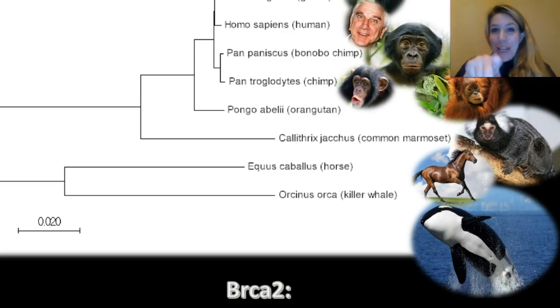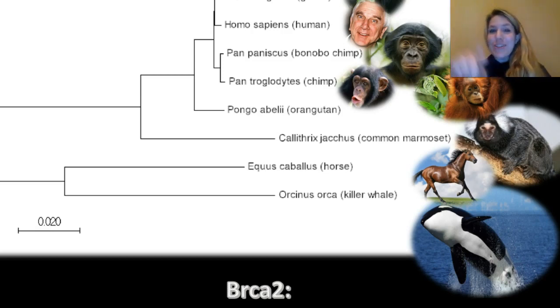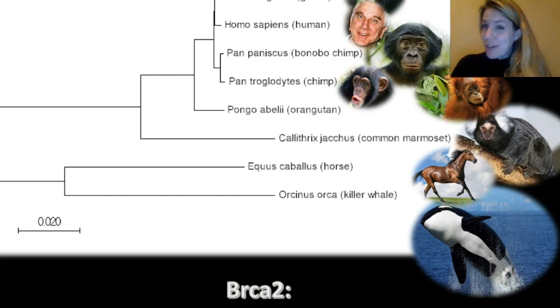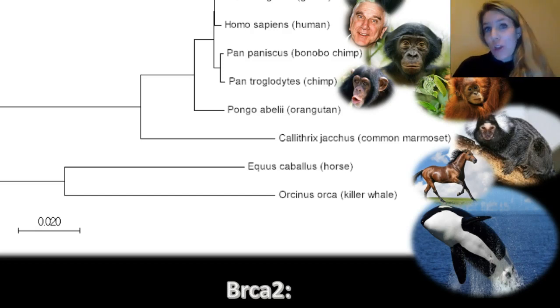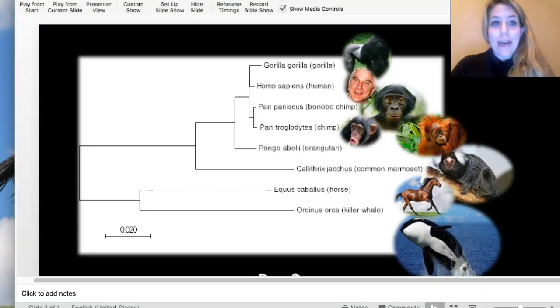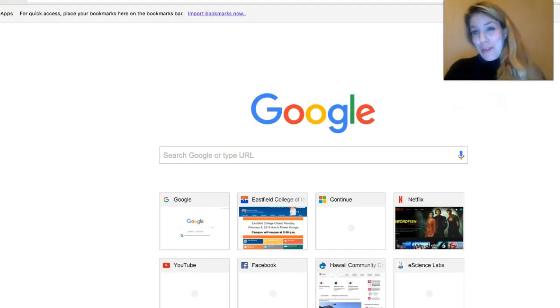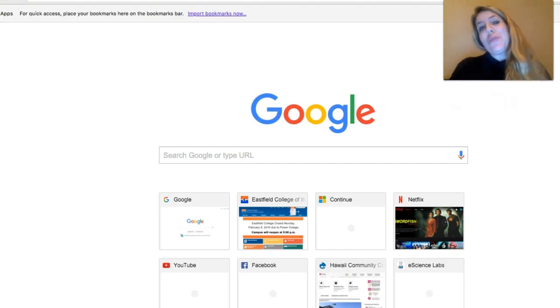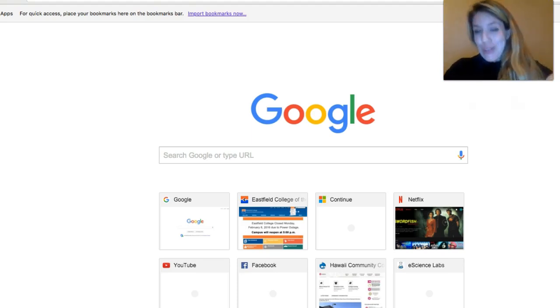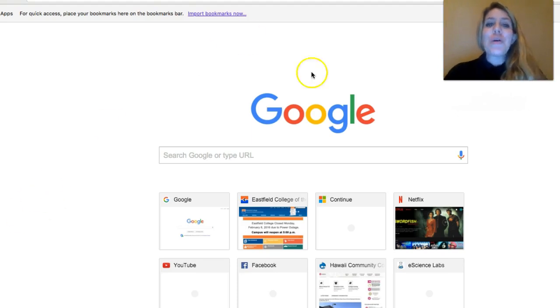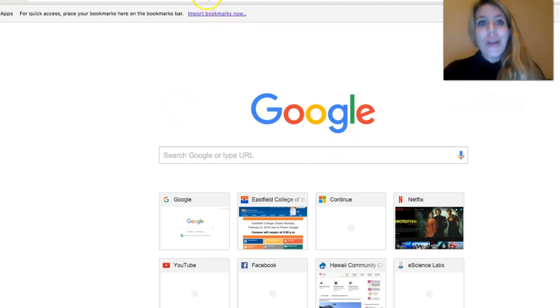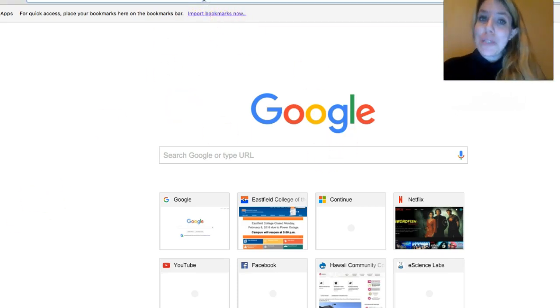You just did molecular evolutionary biology research. Put that on your resume. All right, so now real quickly I'm going to show you how to look up a gene of your own. Once you've mastered that, I'm going to show you how to find a gene of your own to try to do a phylogenetic tree in MEGA.